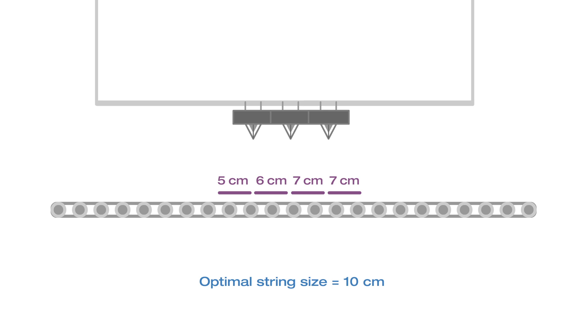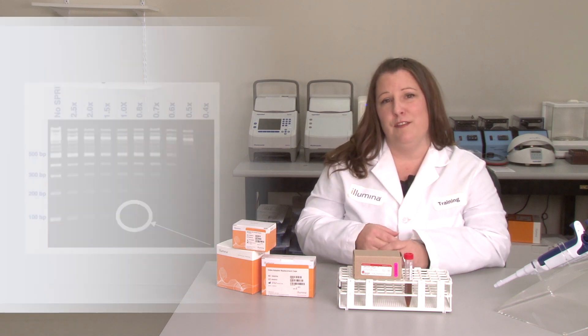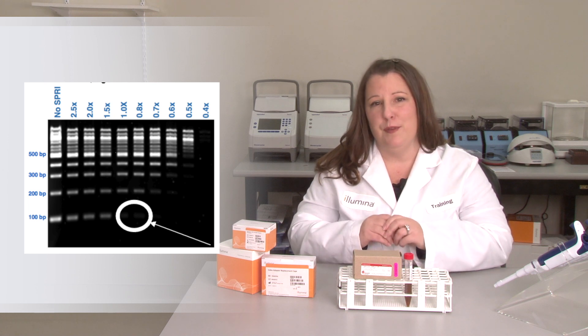Some of these pieces are well short of our desired 10 centimeter product. So what does that mean for the library prep? To remove primer and adapter dimers, the cleanup steps are designed to remove fragments below 200 base pairs. DNA that is too short will be removed, resulting in low or no yield.